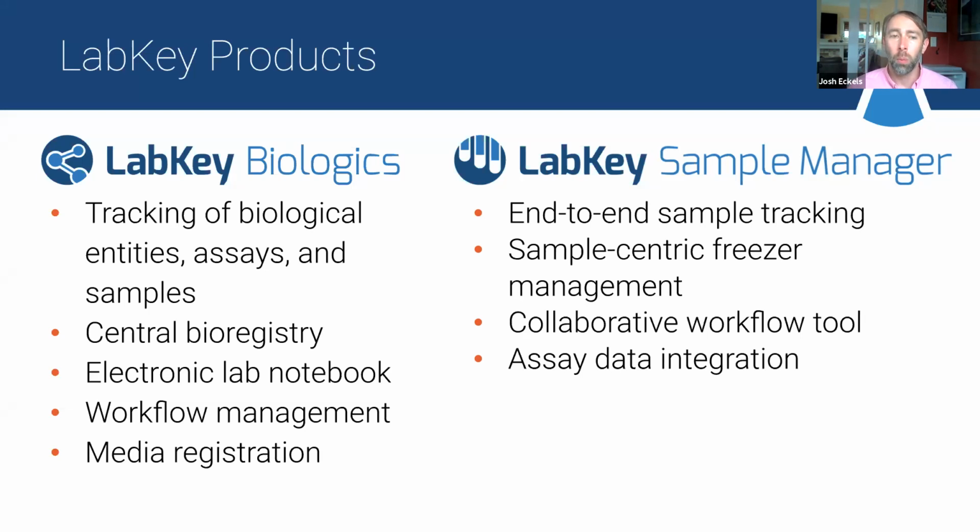And obviously, we've been thinking about how we get mass spec analyses fed in, and Panorama's been adding new support for multi-attribute method. And so I wanted to make sure folks knew about that.